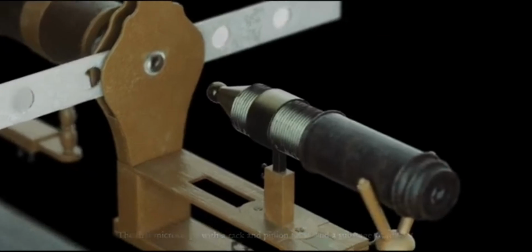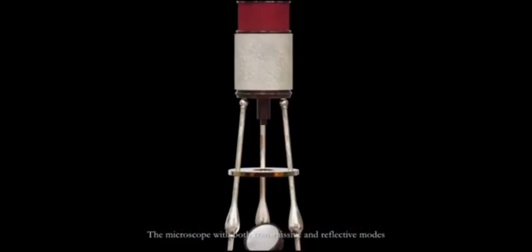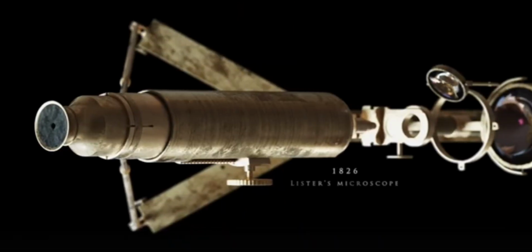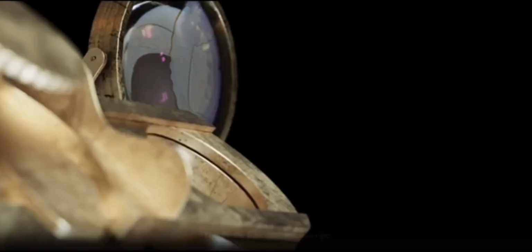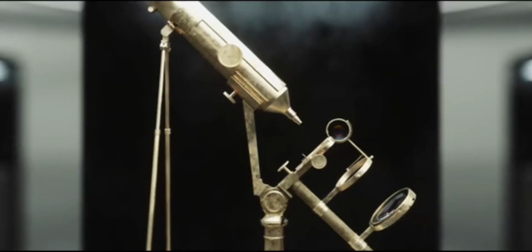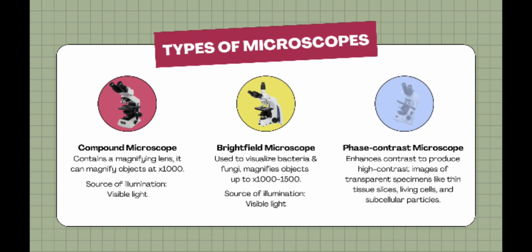The microscope has seen significant revolutionary changes since its original discovery in the 1600s, becoming more sophisticated and involved with time. The basic prototype created by Van Leeuwenhoek gave rise to a variety of microscope variants. There are 9 types of microscope. Starting with the compound microscope. It contains a magnifying lens. It can magnify objects approximately 1,000 times their original size. Visible light is its main source of illumination.